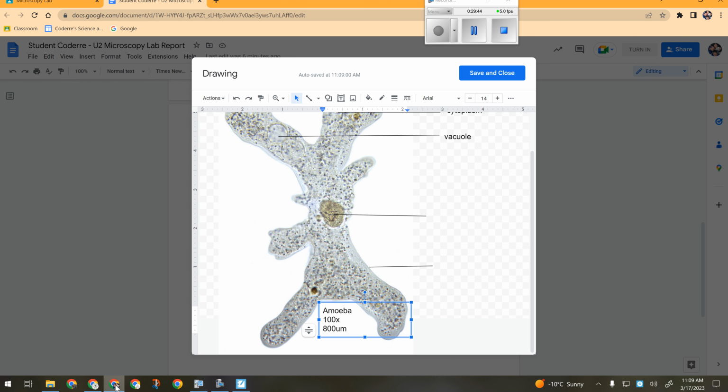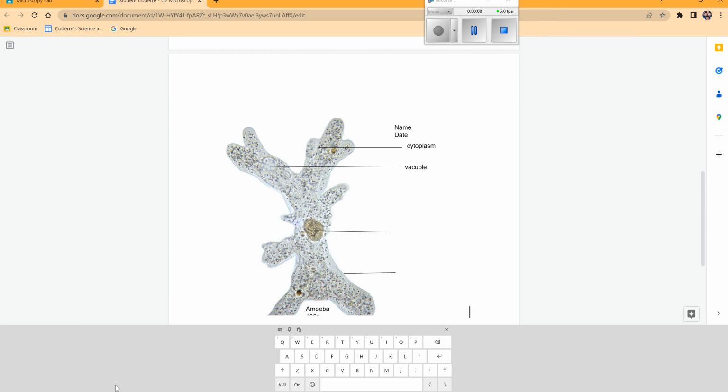Okay? All right. Everybody follow on the lab drawing? So you're going to do one of those for each of your organisms. I have a separate recording of this exact procedure in with the lab. So if you're getting lost on it later when you're putting your lab report together, you can watch it again. It's the same deal. That's all you have to do. Now you can save and close, and it inserts it right into your Google Doc. Your lab diagram is done.